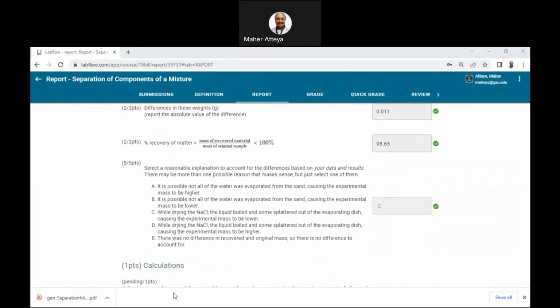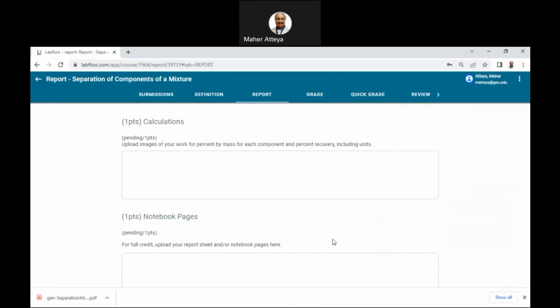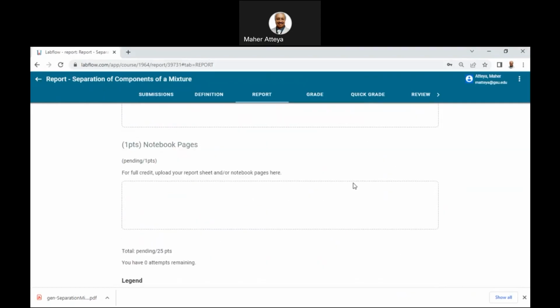Paste. That's all the data we have. I did not upload any images, but all the calculations are shown in the file, and the lab report should be done. With the circles added here, the data with the green circles means calculations are correct. We'll add it in the section of the lab report called data and results.